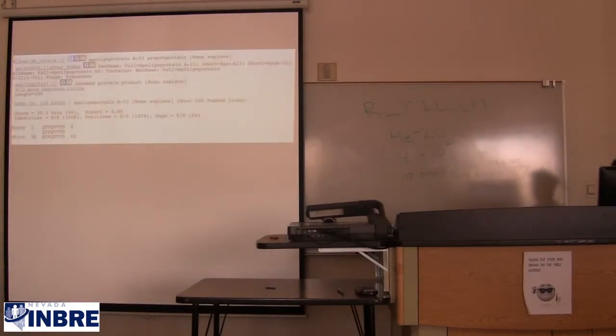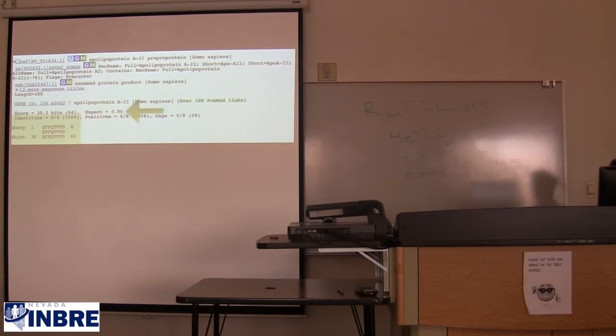But what if you search a large database with an 8 amino acid query? The best alignment you can get is 100% identical over 8 residues, and that is likely to have an e-value around 1 or higher. If what you know or hypothesize about that motif is consistent with the biological function of the database sequence, then the alignment may indicate biological relevance, even though such relevance cannot be inferred on statistical grounds alone.